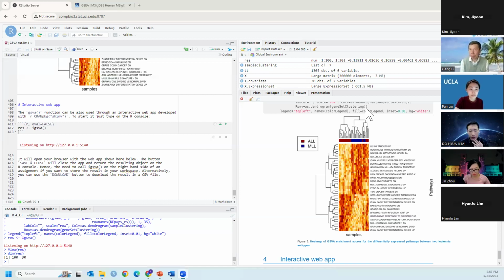I was wondering for this kind of scRNA GSVA, does the normalization impact the final result? Will a different type of normalization method impact your result? Yes, I think normalization has a great influence on the downstream results.